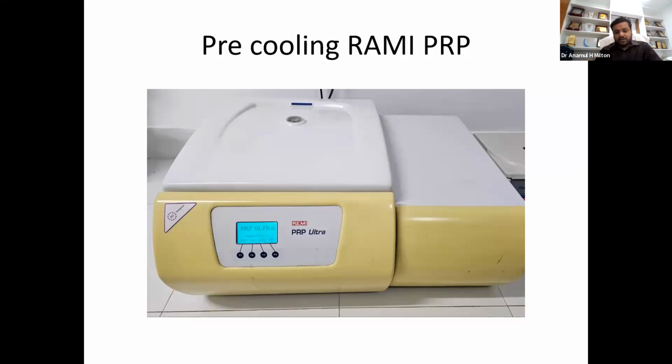Second, when we give this, it is called the separating method. After separating, we load the commercial kit, like the Dr. PRP kit. After that, we give F3, that is concentrating. Here we do not have to manipulate how much RCF or how much rotation; there is no need to calculate these things. That is also a presetting manner.